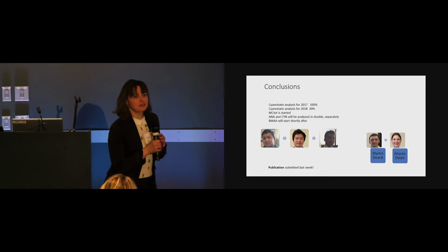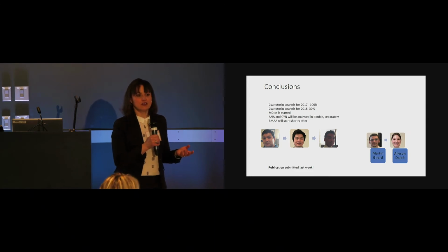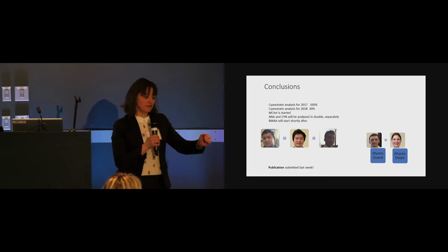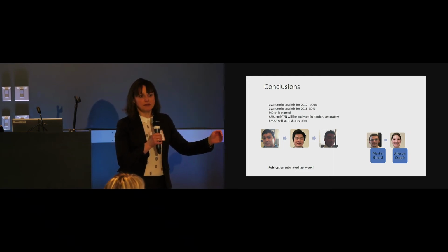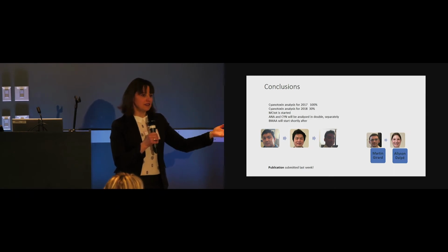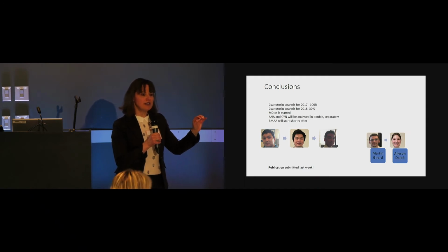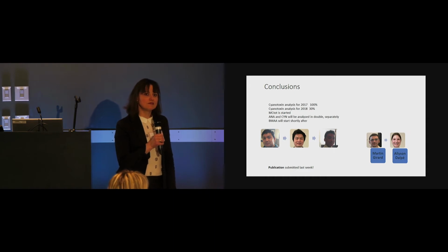But ELISA is already known as a method that is applied in the field at first. It's easy to apply, so people use it, and if they get something with ELISA, they go further and do MS. But a lot of our samples are in such a low range that with ELISA they won't be detected at all. So, yes.